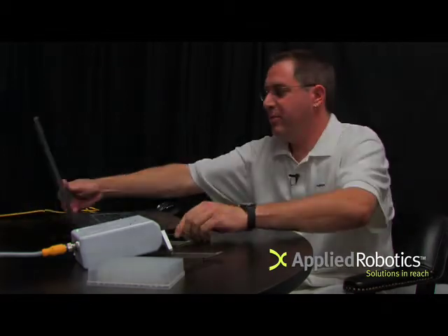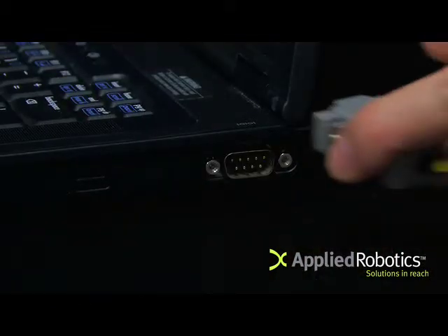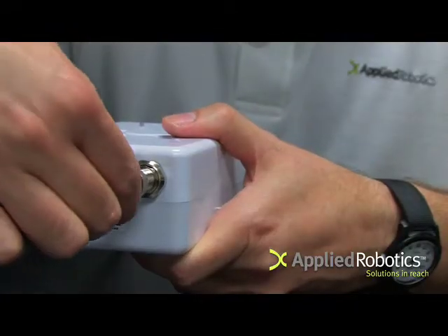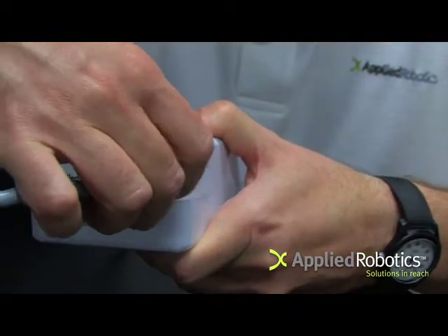Hi, I'm Mike Bowman from Applied Robotics and I'm here to show you how to get started with a smart gripper. First you need a computer with an RS-232 port. Connect 24 volts DC power and RS-232 to the smart gripper.